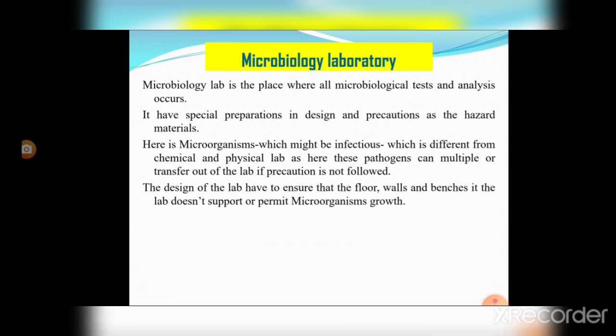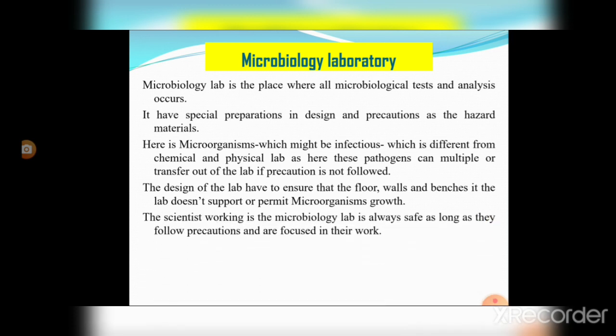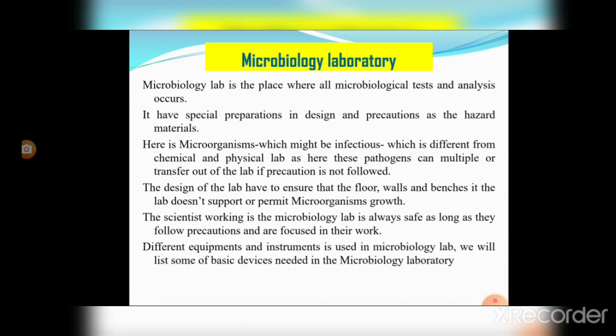The design of the lab has to ensure that the floor, walls and benches in the lab do not support or permit microorganism growth. The scientists working in the microbiology lab are always safe as long as they follow precautions and are focused in their work. Different equipment and instruments are used in a microbiology laboratory. We will list some of the basic devices needed in a microbiology laboratory in upcoming videos.